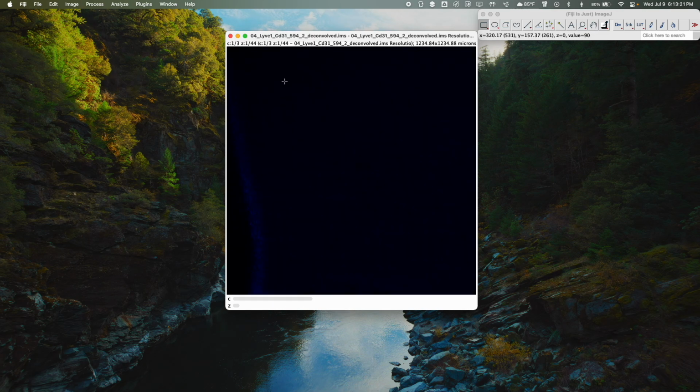And in my case, I need to figure out whether I can take the lacteal quantification by seeing if this is a picture of a slice of the lacteals that are there, or if this is extracting the lymphatic vessels, a picture of the lymphatic vessels, which we will only need the single channel for. So the way we can tell is if we have that one thin slice where lacteals might be sitting on the outside here. However, if it's just a picture of all the vessels, you'll see it throughout the screen, and you'll know that that is just the image that we need to take.